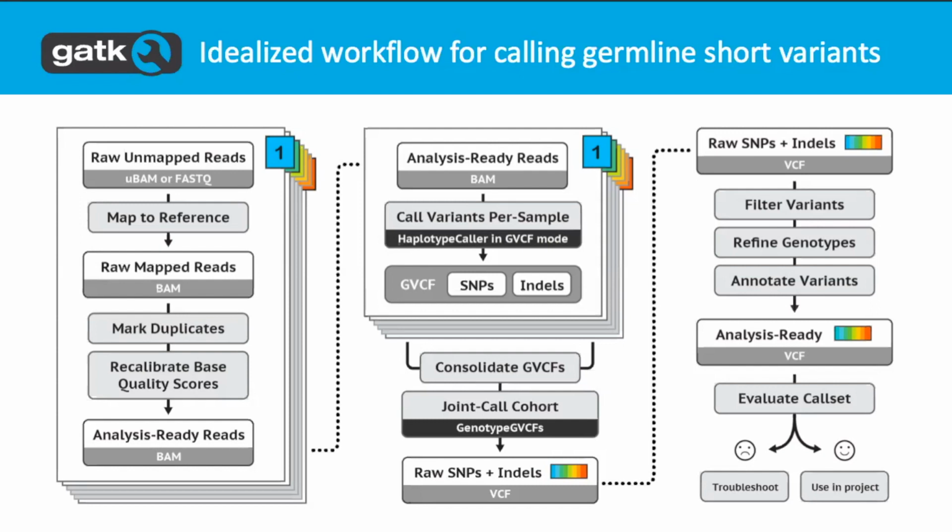The thing is, it really depends a lot on your application. If you're doing large-scale population genetics, there's often not a big advantage in either case. But if you're looking at rare disease variants and you need very high fidelity, that's where it has a bigger impact to be able to have that much higher sensitivity. Go ahead.